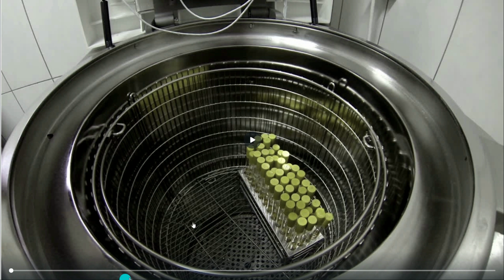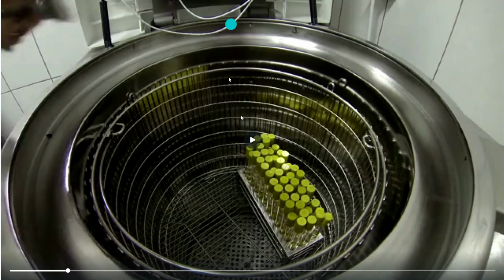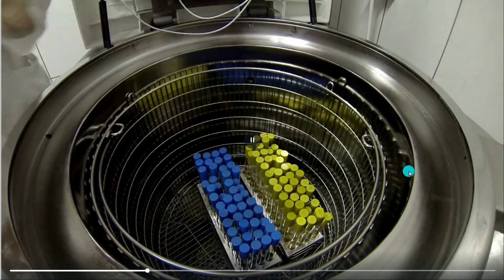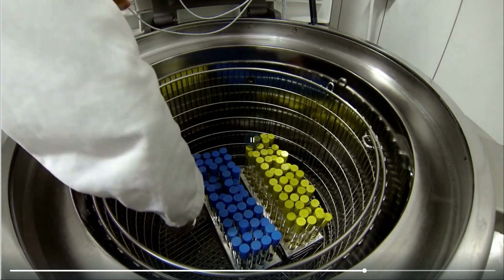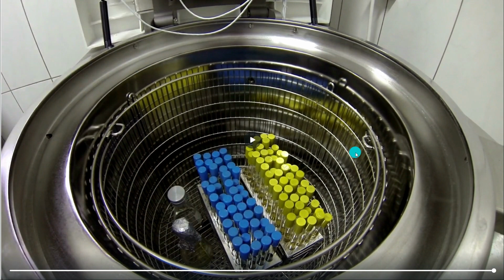In this video you can view that it's a stainless steel instrument where the required components, glasswares or media are placed. Once this is placed, it is covered with its lid, and under the influence of heat and steam, the media and the other components are autoclaved or sterilized.